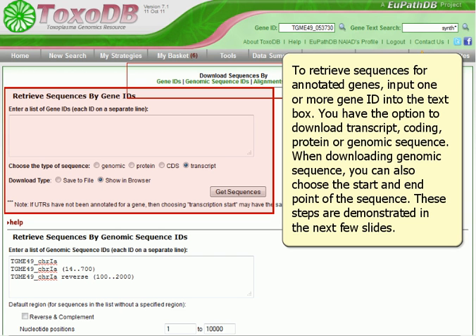To retrieve sequences for annotated genes, input one or more GeneID into the text box. You have the option to download transcript, coding protein, or genomic sequence. When downloading Genomic Sequence, you can also choose the start and end point of the sequence.